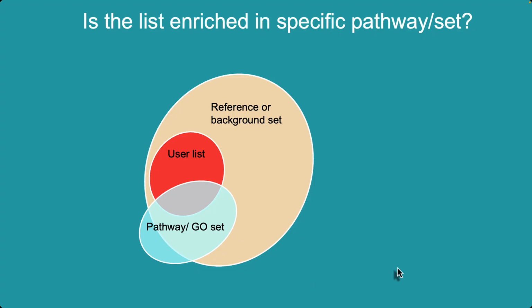So how does overrepresentation analysis work? This analysis uses the Fisher exact test to find if our differentially expressed genes are enriched in certain pathways or functions. In other words, we will compare our differentially expressed gene list with curated pathway gene sets, for example, Kyoto Encyclopedia of Genes and Genomes, Reactome, Gene Ontology, Biological Functions, etc.